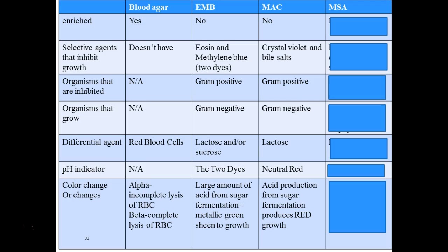Does MSA, mannitol salt agar, have an enrichment? No. Is it selective? Yes, there's a high concentration of salt, 7.5%. It's really salty.